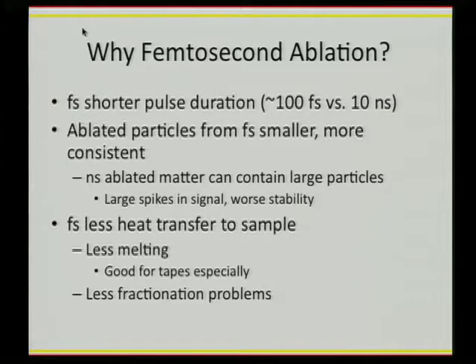Femtosecond ablation also has less heat transfer to your sample, which is especially good for the case of tape, which melts when you get it anywhere near heat. And also, it's especially good for metals. And there are less fractionation problems when this occurs.